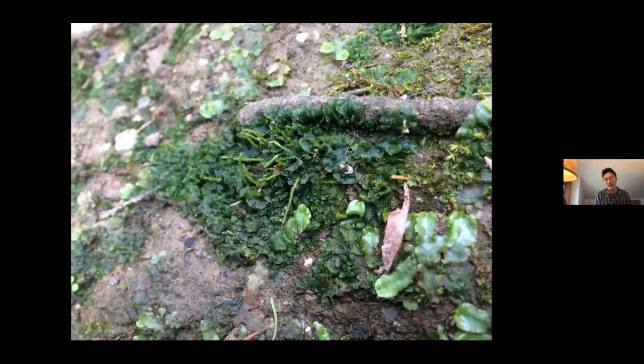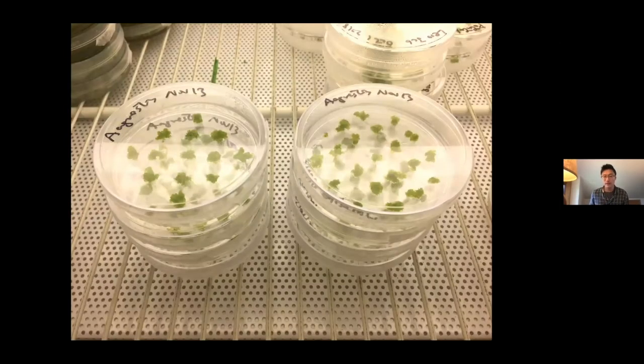So there's no way you can get good results by just picking these plants out from the field. So in our case it's important to establish sterile cultures in the lab, where we sterilize the plants and propagate them axenically, so we have really clean and large amounts of plants to deal with.